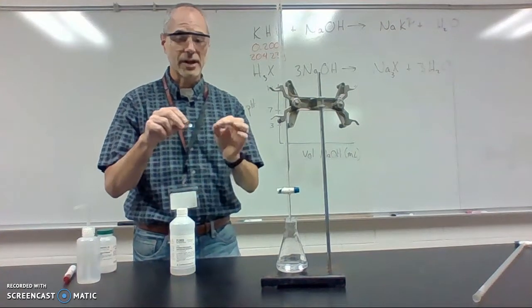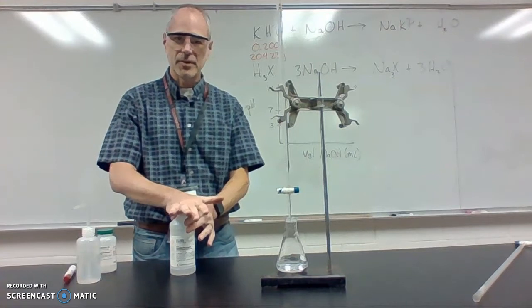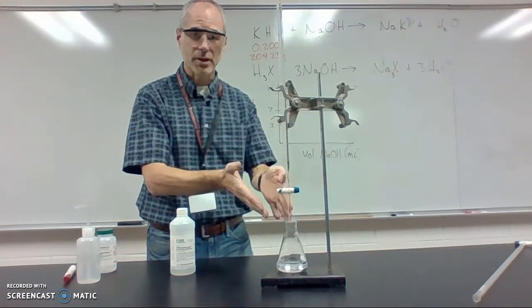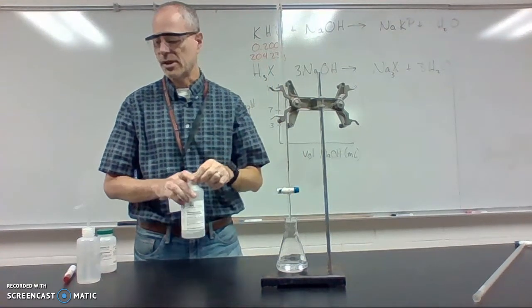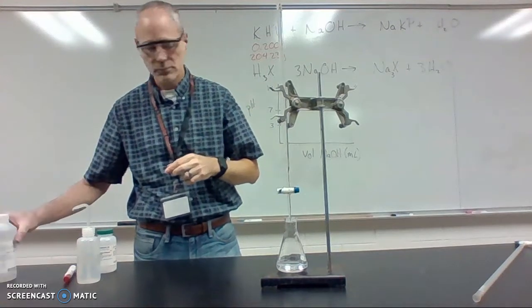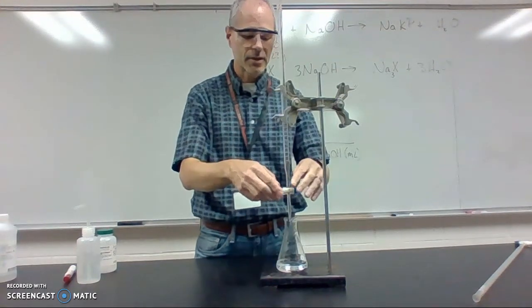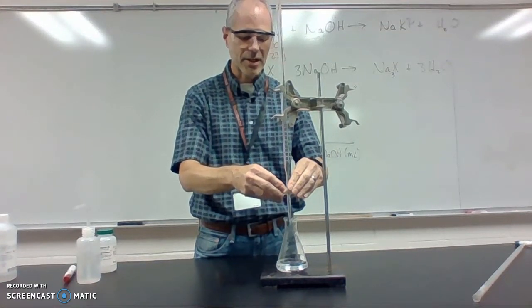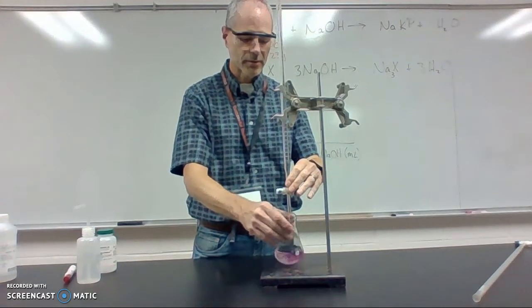Hopefully, if we line this up, the end point, based on the indicator, is within the same range of the equivalence point of the mole-to-mole ratio. We'll talk more about that chemistry in just a few moments. Okay, so I have a few drops, it just takes a few drops of the indicator in here. And when a color change happens, it'll be like a pinkish color. So I'll see if I can get this before it goes all the way over.